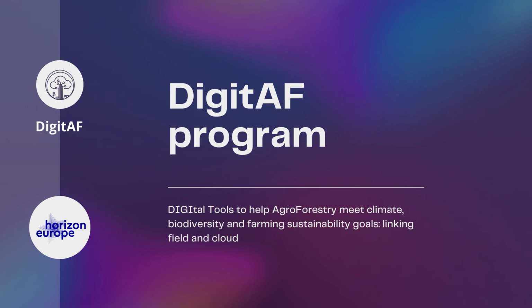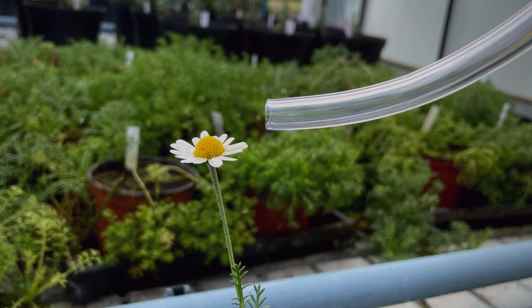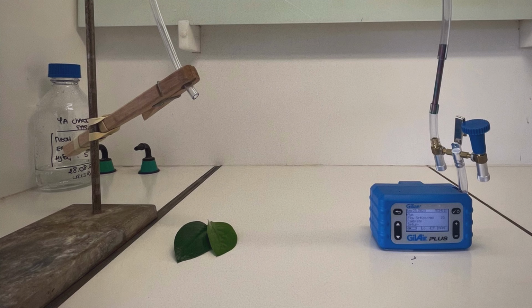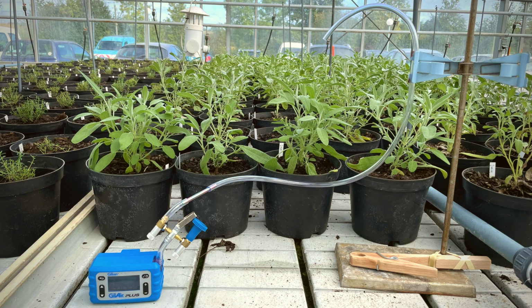As part of the DigitAF program, we use capture on solid support in order to be as close as possible to the conditions that may exist on an agroforestry plot. These different systems are made up of a solid support with different possible shapes such as rods, solid or hollow cylinders. These are impregnated on the surface or in depth with a polymer that will trap certain constituents depending on their physical properties, for example their size, their polarity, or their affinity for the polymer.